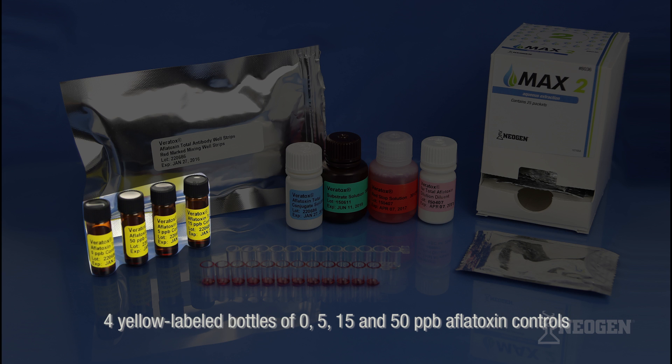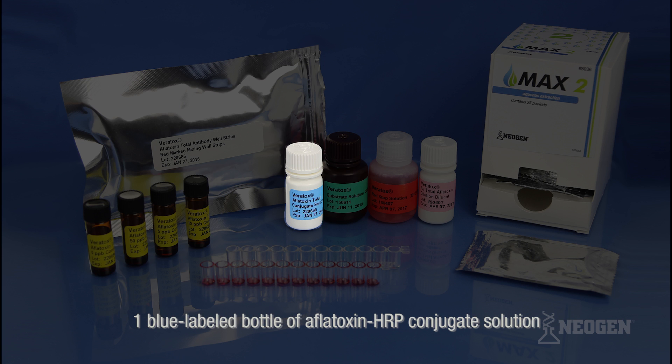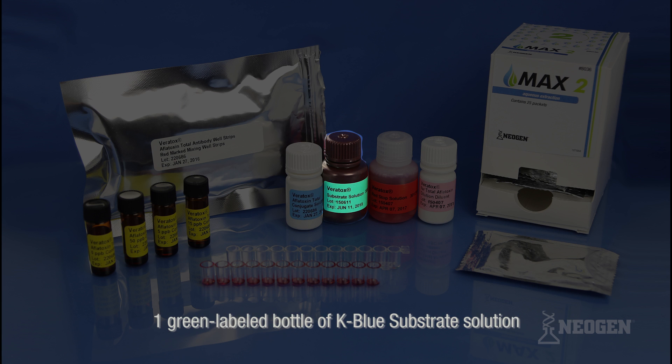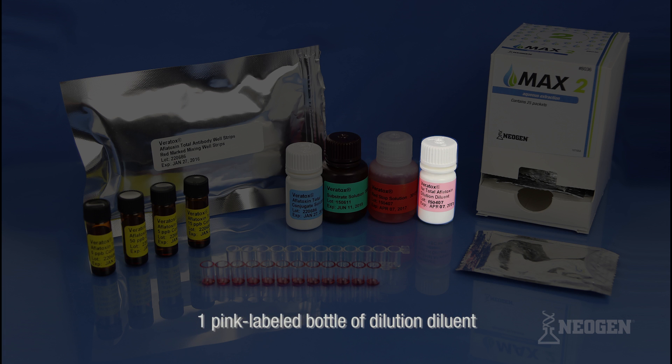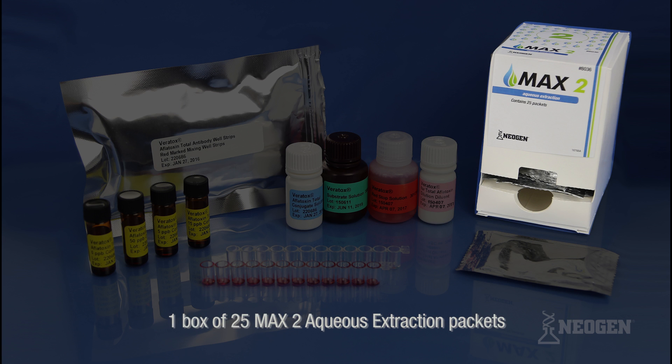4 yellow labeled bottles of 0, 5, 15, and 50 ppb aflatoxin controls, 1 blue labeled bottle of aflatoxin HRP conjugate solution, 1 green labeled bottle of K blue substrate solution, 1 red labeled bottle of red stop solution, 1 pink labeled bottle of dilution diluent, and 1 box of 25 Max 2 aqueous extraction packets.